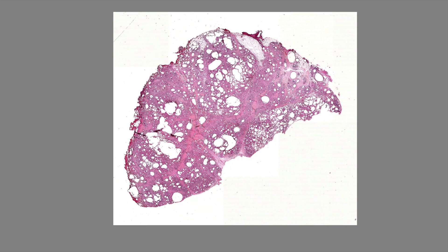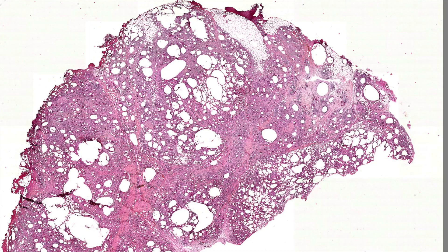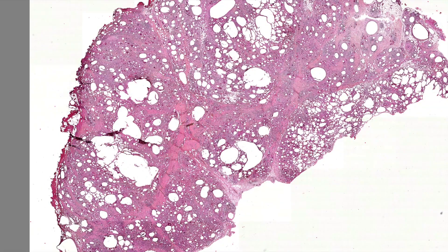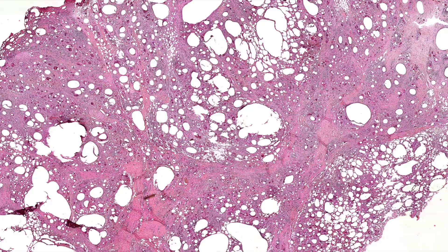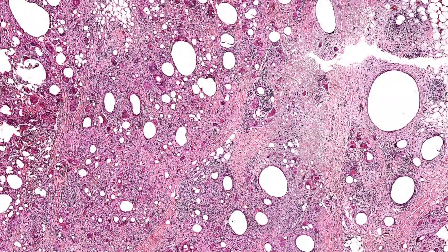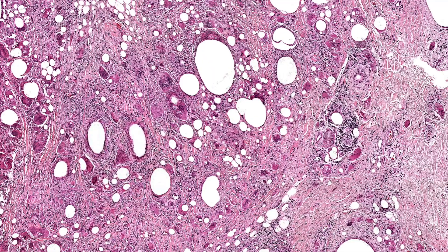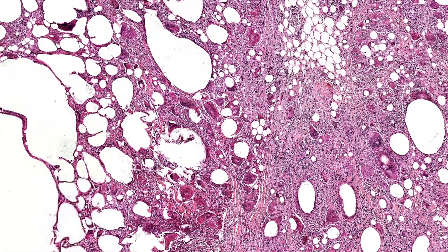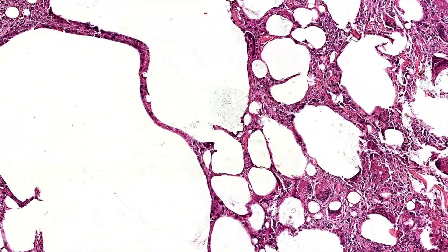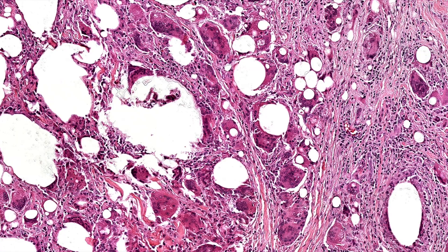This is a great example of something we thankfully rarely see anymore. It looks like fat tissue with some sclerotic septa, but the real thing is this — I don't really like calling it fat because the spaces are perfectly round. It looks maybe mixed with granuloma and reactive changes. So it could be some implant leaking out, this foreign material, something refractile.